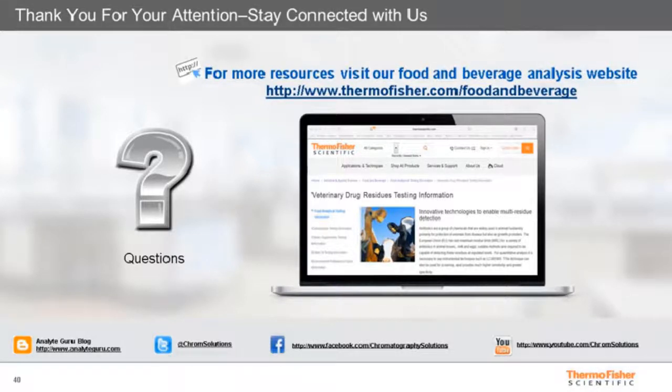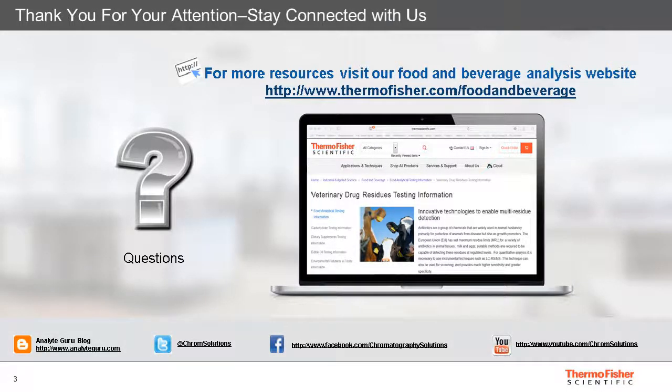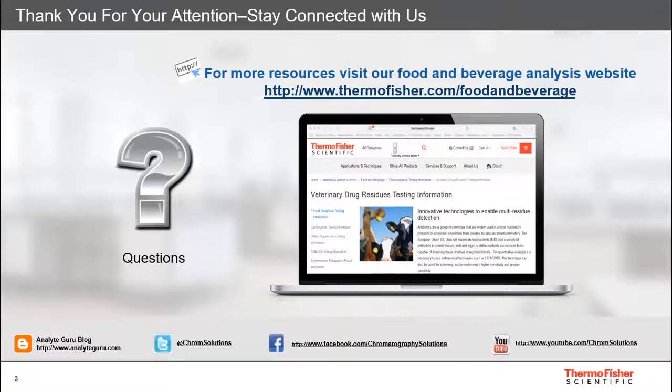Thank you. Well, thank you both for that excellent presentation. We now have time for your questions received via the Q&A box. And our first question is for Richard. Have you tried using standard in solvent with IS so you don't need matrix blank?